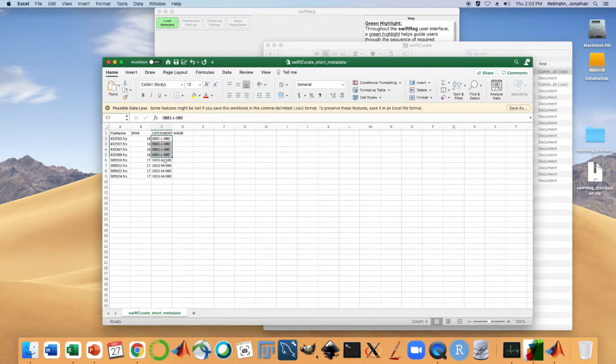The batches are indicated here by the title experiment name. And we'll give them a reference. And for this reference, since there aren't internal standards, I'm going to specify them as just an aggregate. And for the next piece, we have samples to register. And I want to specify each of these as aggregates as well. So I'm putting a 1 in every sample.